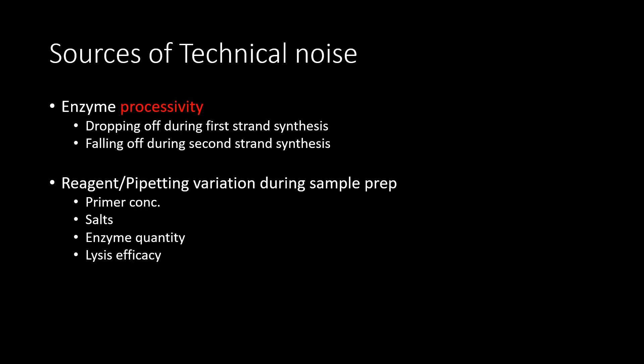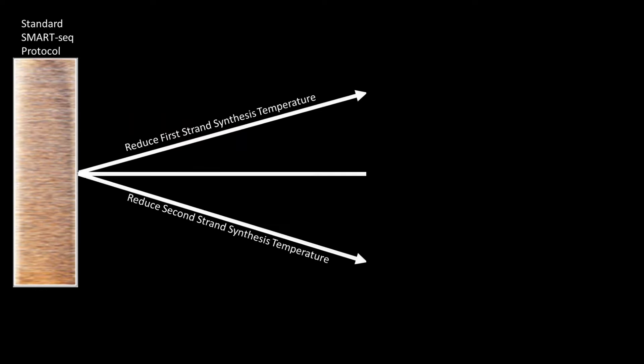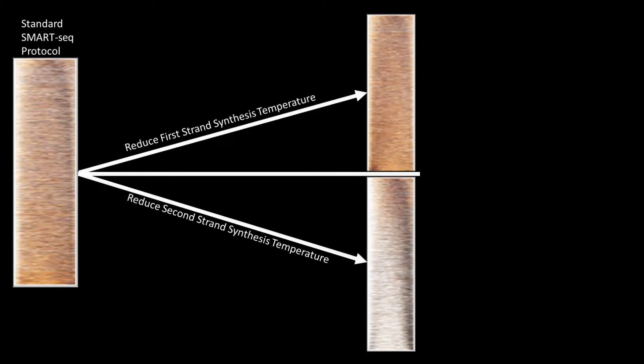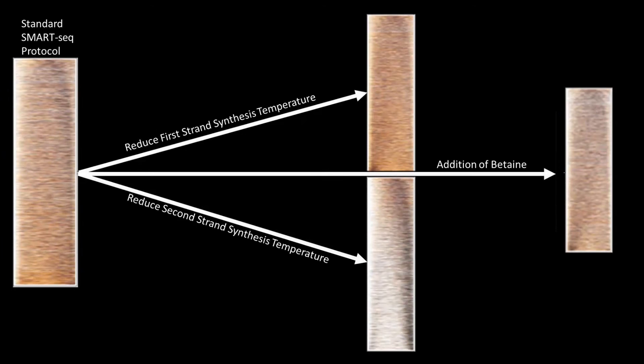Other sources of technical noise include reagent and pipette variation during sample prep, which can affect primer, salt, and enzyme quantity in reactions, as well as lysis efficacy when setting up plates that we sort into with FACS. Enzymes also have their own inherent biological bias, often seen as bias for or against GC content. Looking at differences we were able to get from the SmartSeq protocol, by reducing the first and second strand synthesis temperatures we can see a shift in the bias. Newer versions like SmartSeq 2, with the addition of betaine, can shift the bias further and even start to produce 5' bias in some cases.